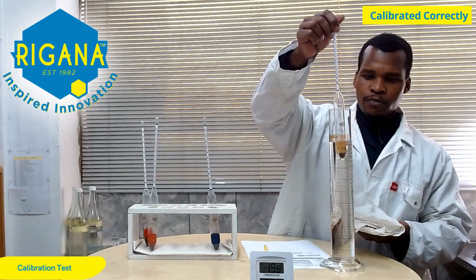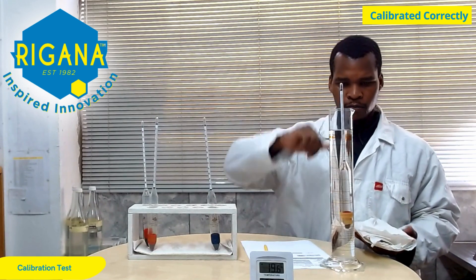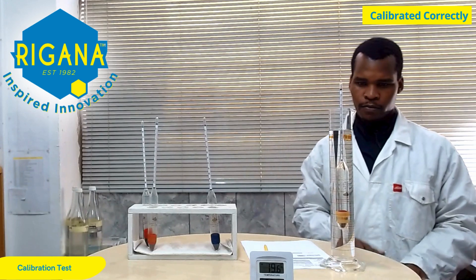Calibration requires patience and accuracy. Using liquids of known densities and a master instrument, the process will be repeated three times for each hydrometer being tested.